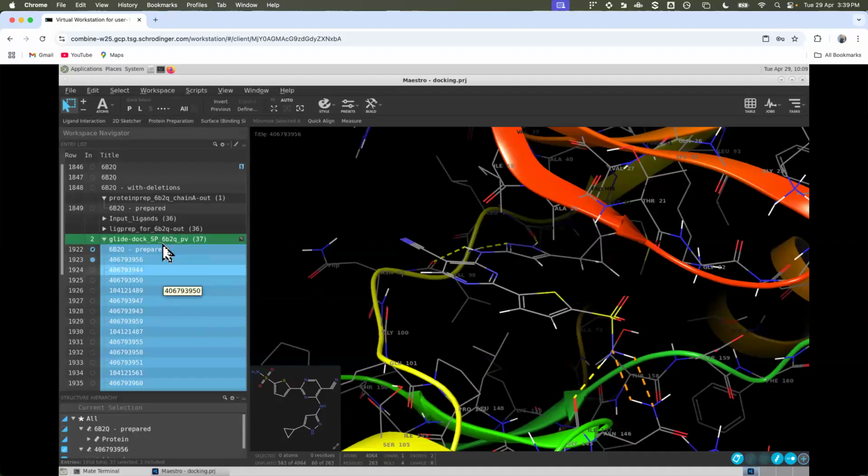So first click here to select all those entries in the Glide drop panel. Select means that the titles will be highlighted in blue color. So click that one, it will be like this. Click on this Glide entry, and all titles will be highlighted in blue color. All of you are here? Yes, no?